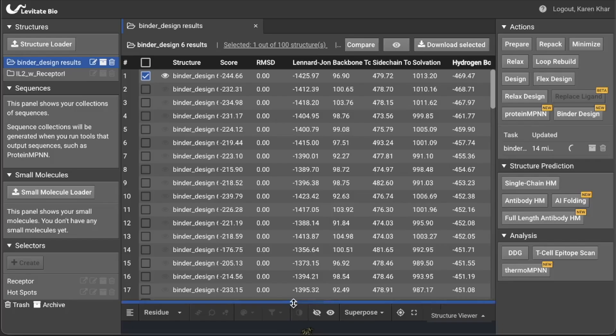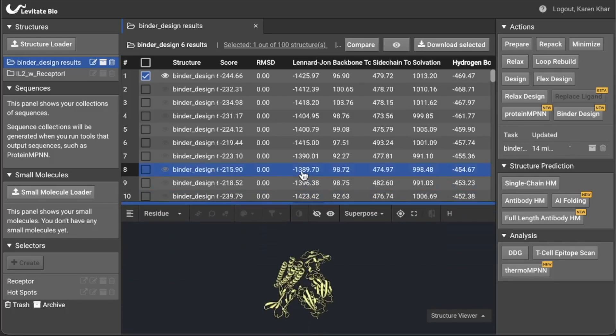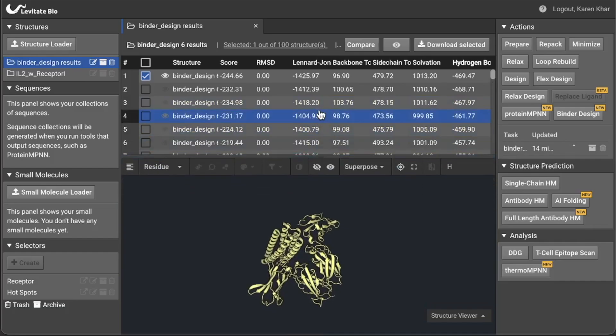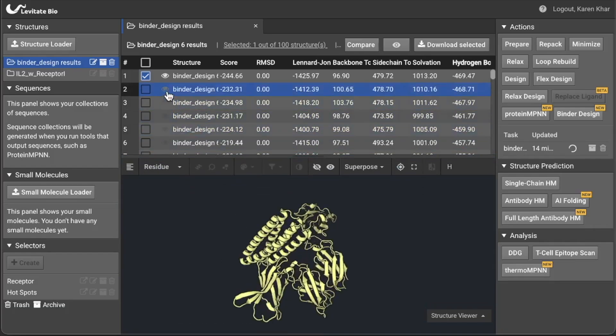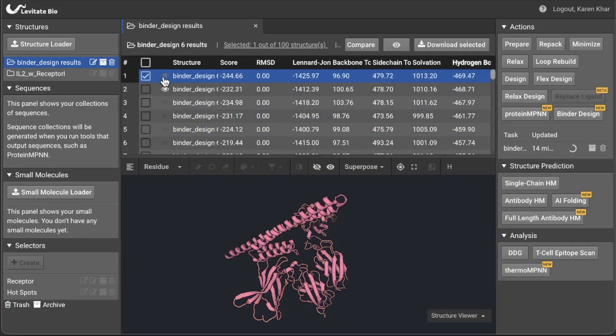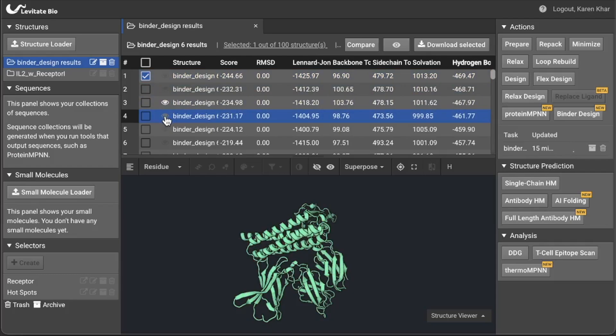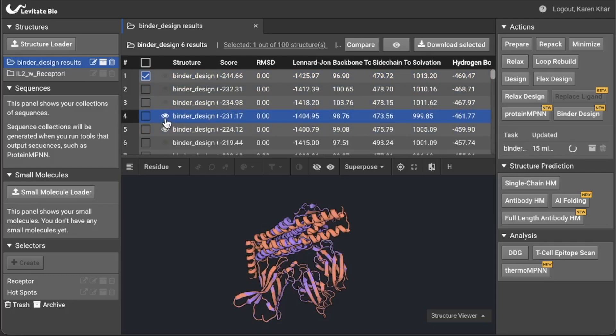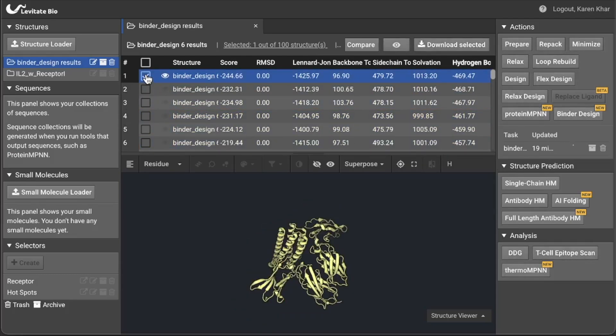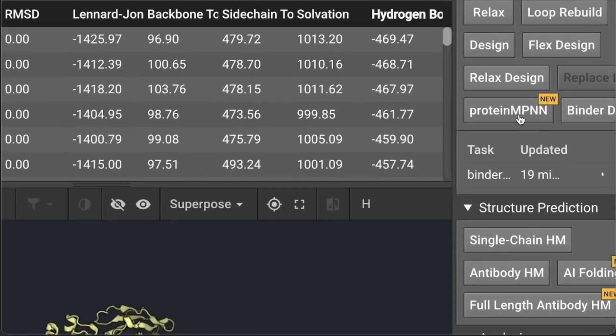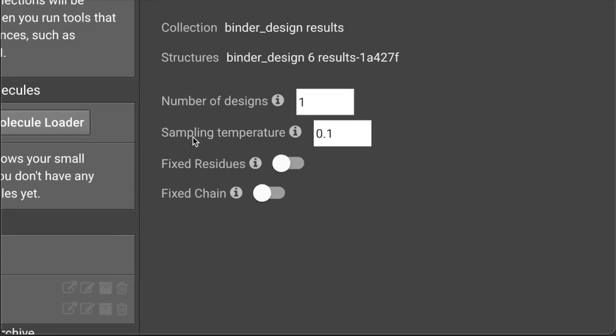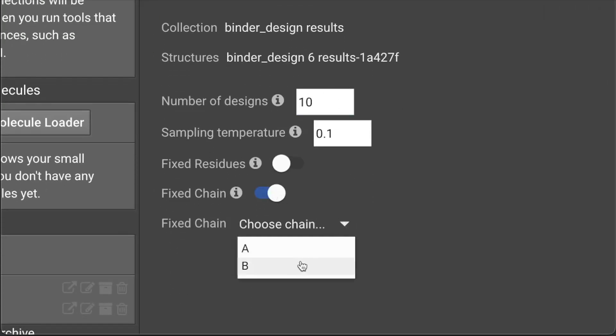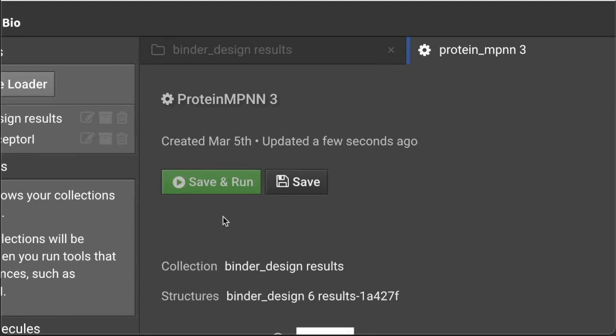Once you have the de novo structures, you can select a few diverse confirmations from the output. The next step is to create a library of sequences for each confirmation. For each one, click Protein MPNN and tell it which domain needs to be designed. Tell it how many sequences to create and just click run.